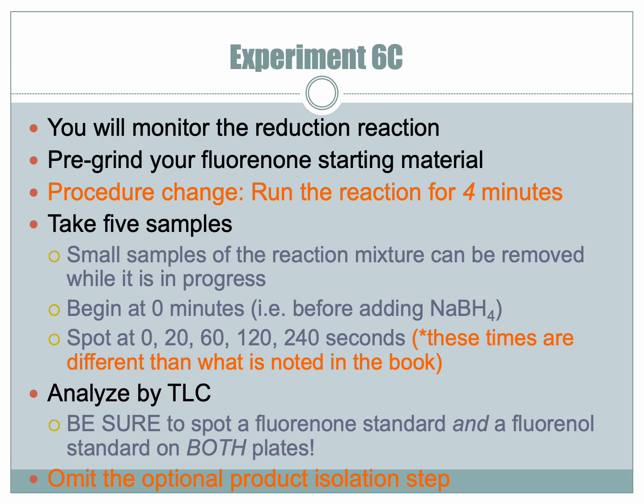And then 20 seconds later, we'll get another spot. 60 seconds after we start, we'll get another spot, then 120, then 240, and so on. Note that these times are different than what is in the book. We had to extend the reaction time to make sure that we actually finished it. And then we'll analyze by TLC. And so we have to spot a fluorinone standard and a fluorinol standard. So when this new spot appears, we know what it is. So we have to put our reference compounds on the plate so we can compare our unknown to a reference compound.